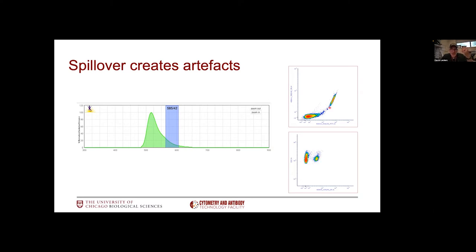To identify spillover issues, there's a couple of things we can look at. One is the diagonal of your positive fraction. Diagonal typically indicates this correlation going on. You will have that otherwise if the two markers are co-expressed or if one antibody attaches itself to a second one in your assay. Another reason is if cells are dying. As they die, the autofluorescence increases in all channels simultaneously.